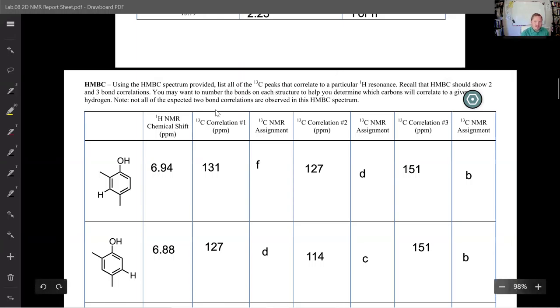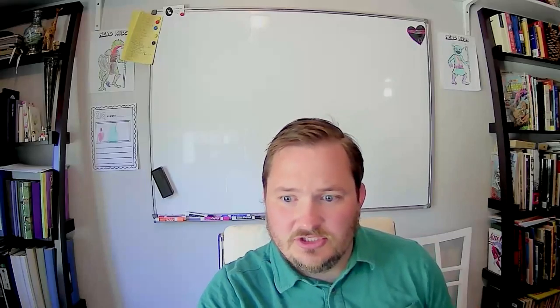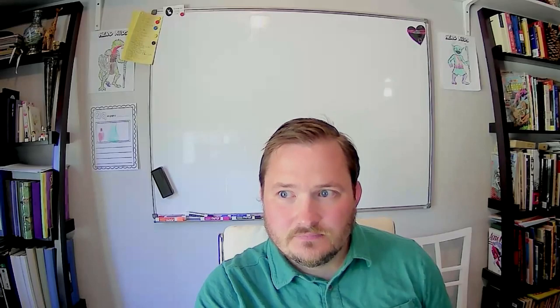And just as a note, it also might be useful to keep track of whether you're talking about carbons or hydrogens. If you refer to them as carbon sub F, C sub F, or H sub F, to distinguish between the carbon in position F or the hydrogen attached to carbon F, that might be a helpful way of distinguishing. Cool. Makes sense.